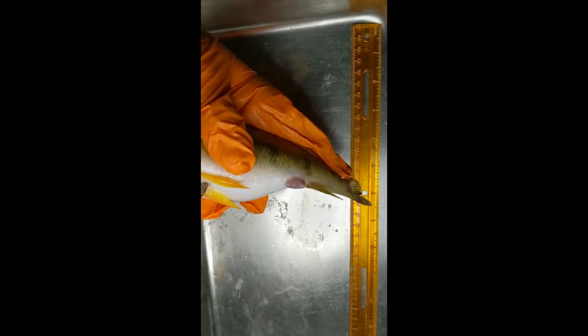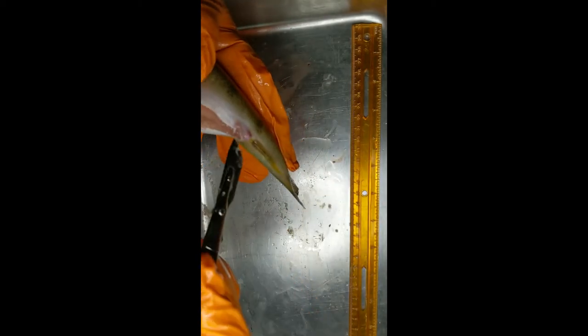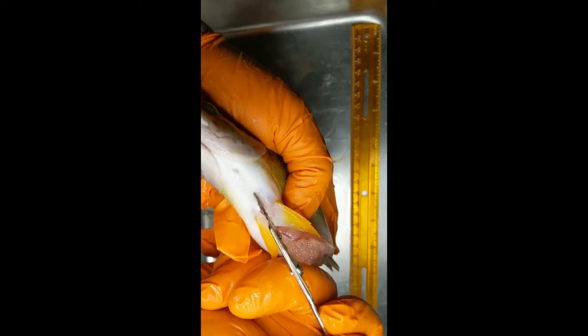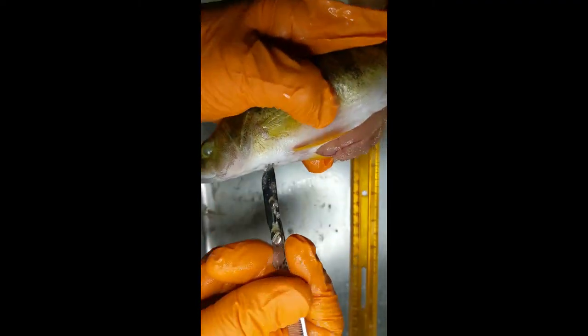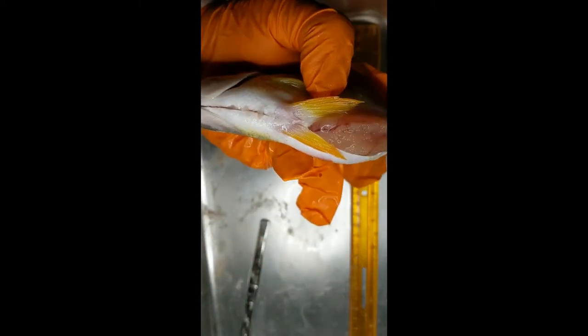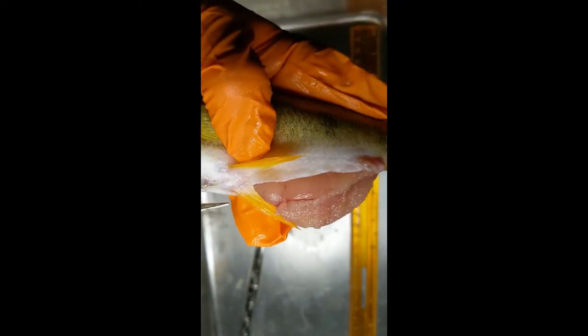Now we're going to cut into it. I like to start with the scalpel just behind the front fin, cut from the back to right about the anus, and then cut in front. The reason I don't cut straight through is because it's pretty bony, so I'll use scissors to cut through that — it makes it a lot easier. We'll snip through that bone with scissors, which opens up the entire chest cavity.